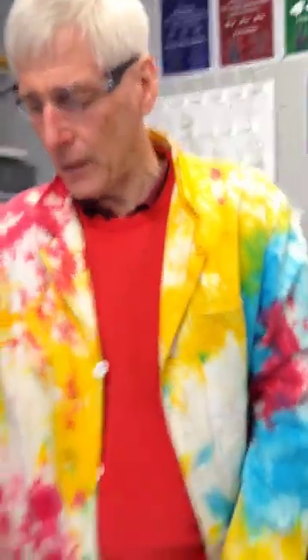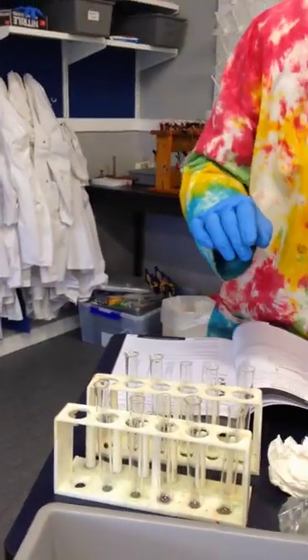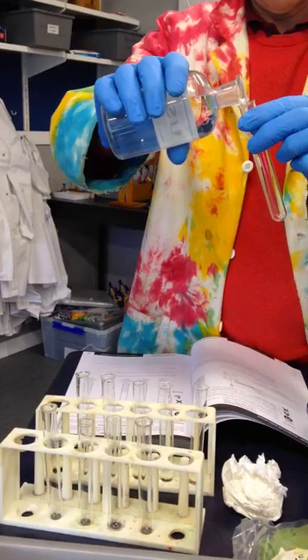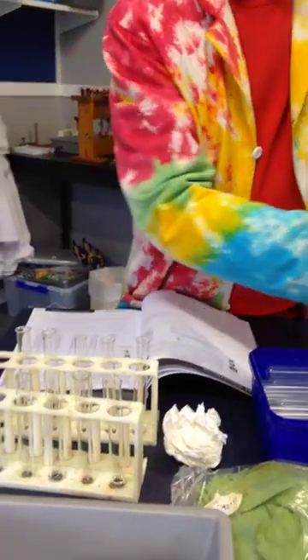So now what I'm going to do is the same demonstration, but I'm going to put hexane into each one of them. So just give me a minute to put, so I'm going to take methanol, ethanol in that one. I'll do them in the same order.